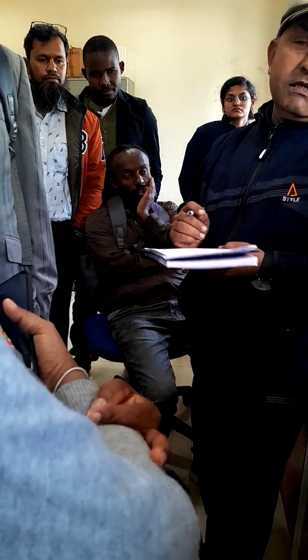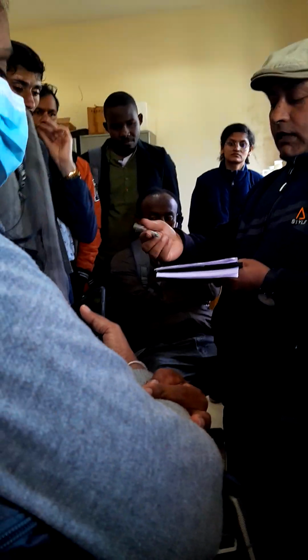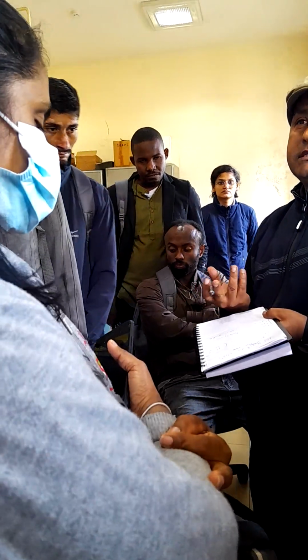Because if you are a researcher doing the cetane number, you require at least 1.5 liters of sample if you are doing it by the CFR engine. But if I am doing research, I have only 10 or 20 ml of sample. How do I come to know the cetane number?